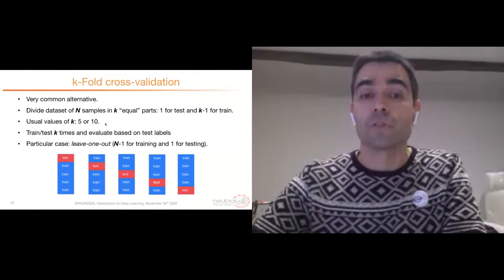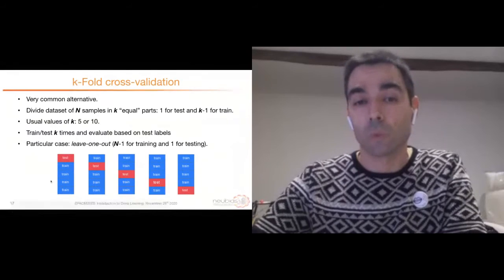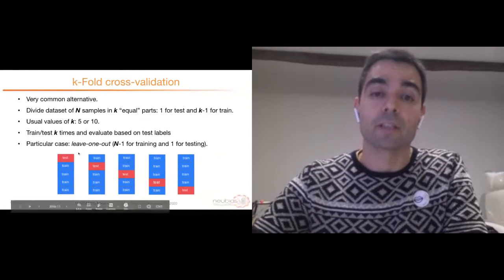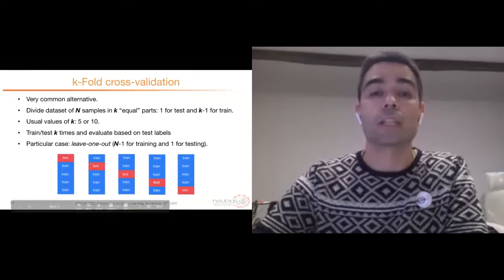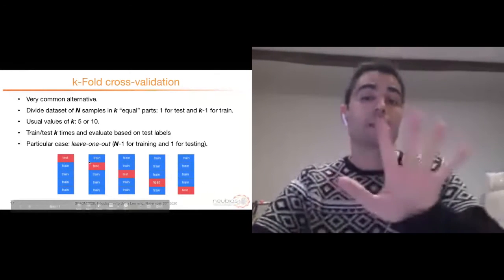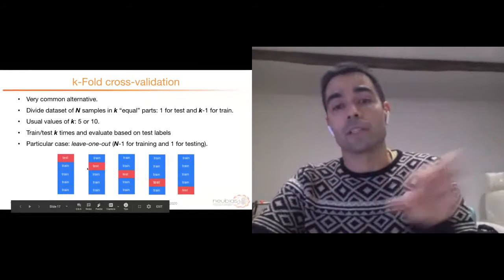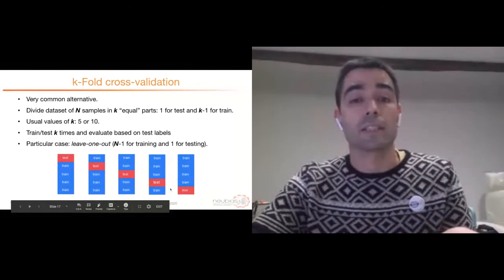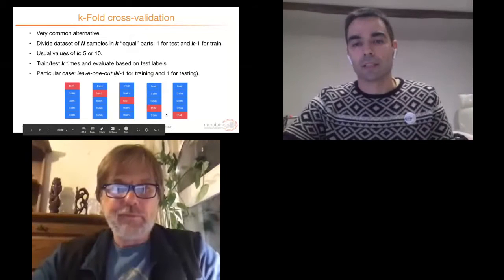And then we select 4 subsets for training and 1 for testing, and we train one model like this, and then we repeat this 4 more times, training one model from scratch each time. So we have at the end 5 different performances on the different test subsets, but we usually provide the average as the result.